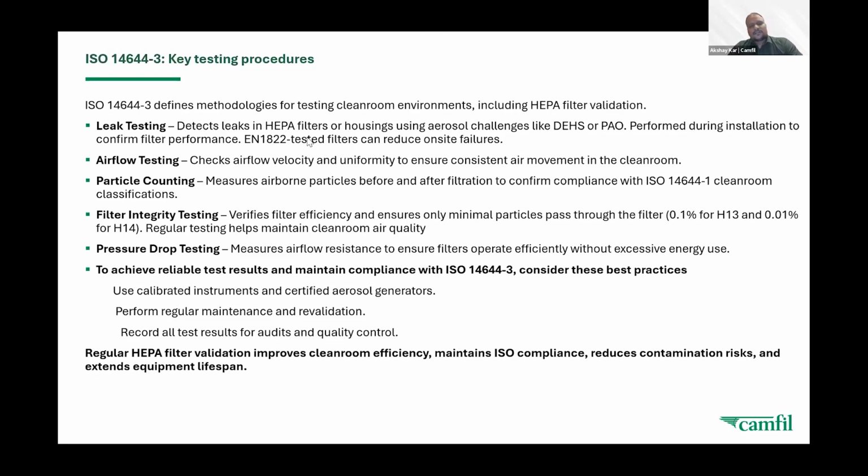To achieve reliable test results and maintain compliance with ISO 14644, these are the best practices we should follow during testing of the clean room. One is to use calibrated instruments and certified aerosol generators, perform regular maintenance and revalidation, and record all tests for audit and quality purposes. Regular HEPA filter validation improves clean room efficiency, maintains ISO compliance, reduces contamination risk, and extends equipment lifespan.